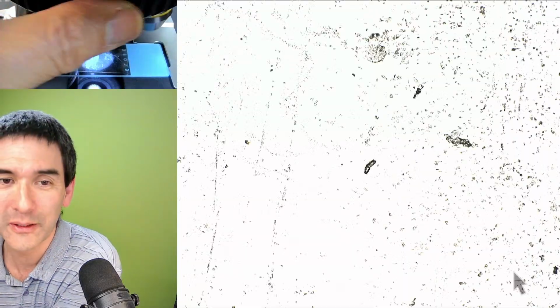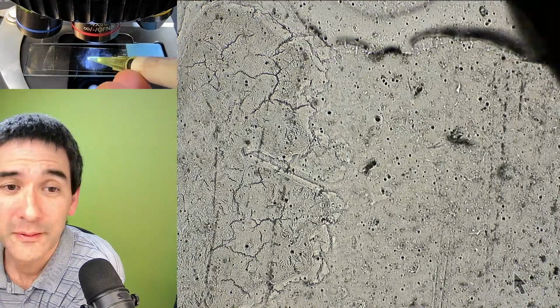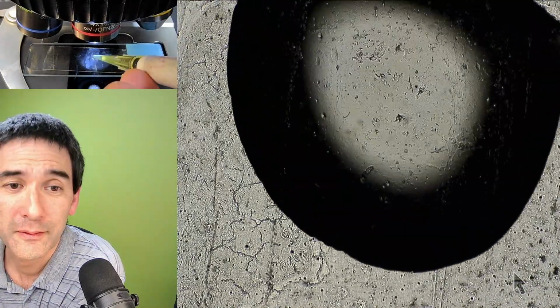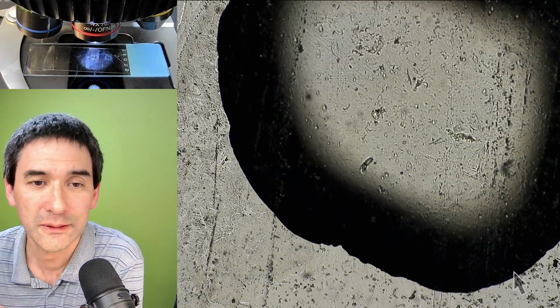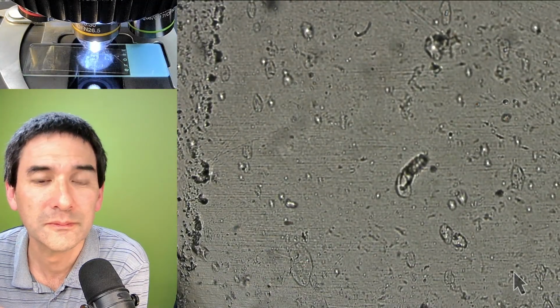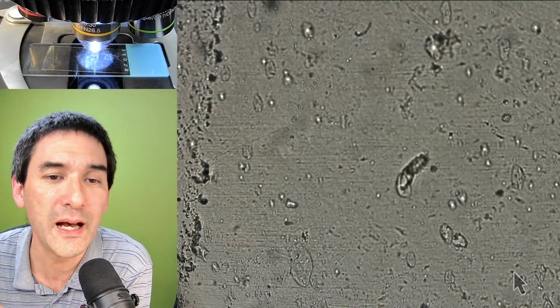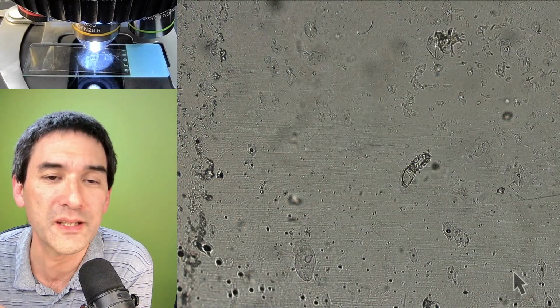Otherwise, we're going to be doing the same thing. And again, if it turns very transparent, then we know that it's probably dead. Let's do the following. Because sometimes when you add oil, it also looks transparent. Oh, that's a pity.